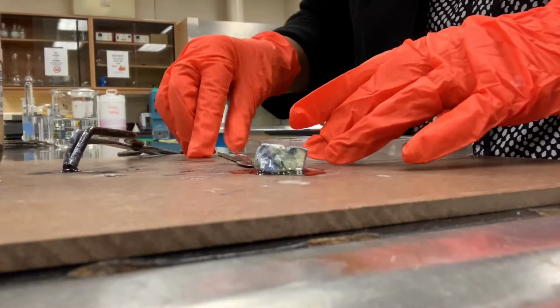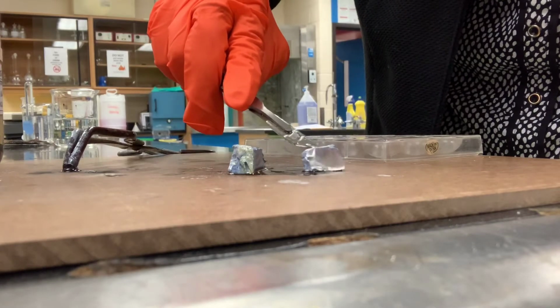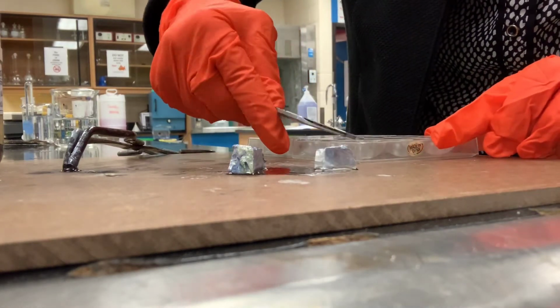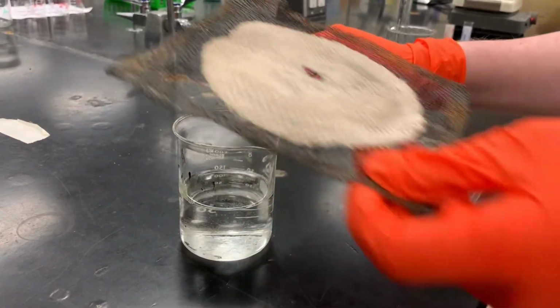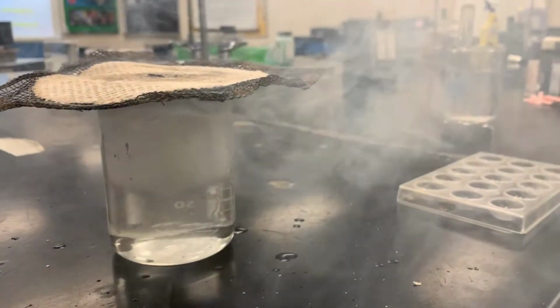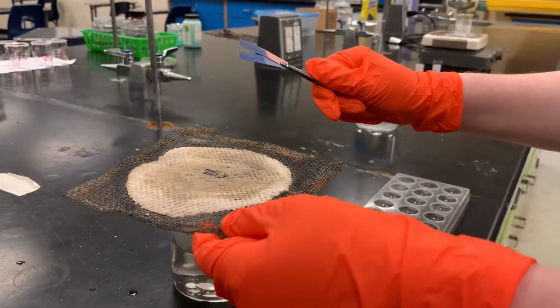Okay, now I have a piece of potassium. You're going to see that when I cut into the piece of potassium, it's quite soft, but you can see there that it is lustrous and it's silver. So we're going to use a small piece, put that into our spot plate to then react. We're going to put the potassium in the water. Testing with litmus paper, and again we see the red turns blue and the blue stays blue.